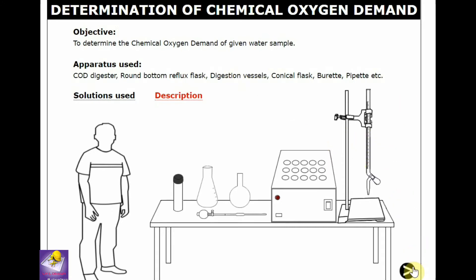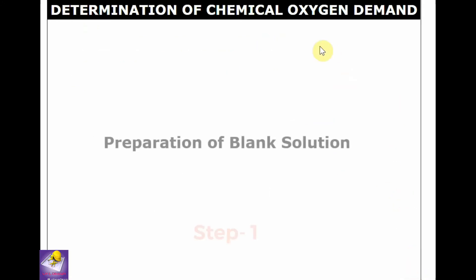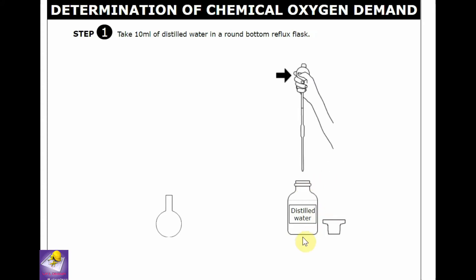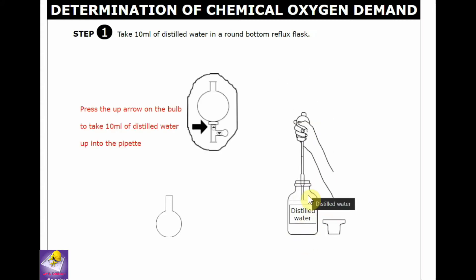Let's the test proceed. First part is the preparation of blank solution. Take about 10 ml of distilled water by pipette to the reflux flask.